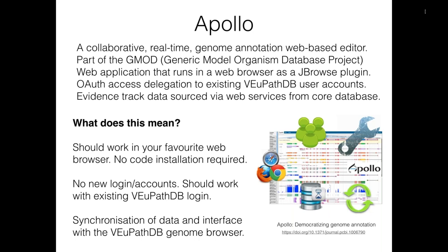There's synchronization of data and the interface with the VEuPathDB genome browser, so the JBrowse instance accessible from the main gene pages will have exactly the same track names and data inside of Apollo as it does inside of JBrowse in the main site. There's also a link to the latest publication on Apollo where you can find out more details about their development path and how other people are using it.